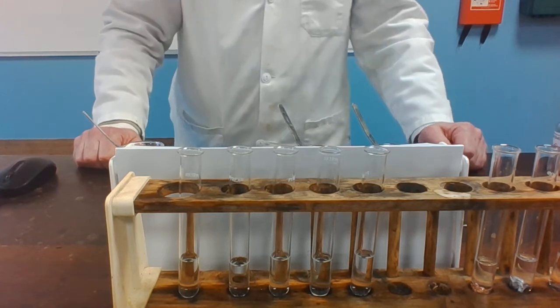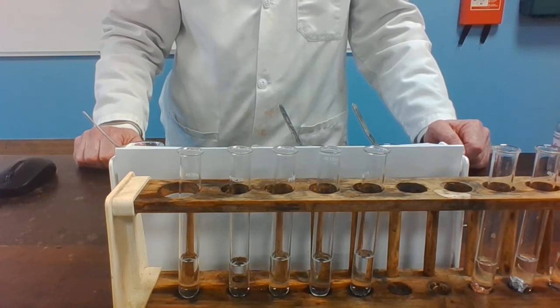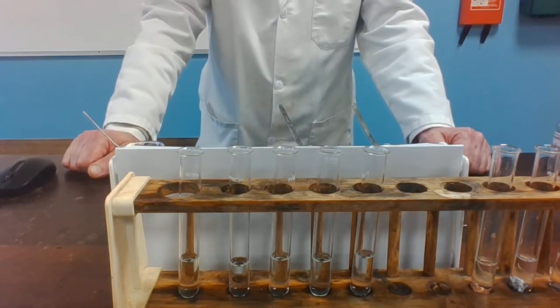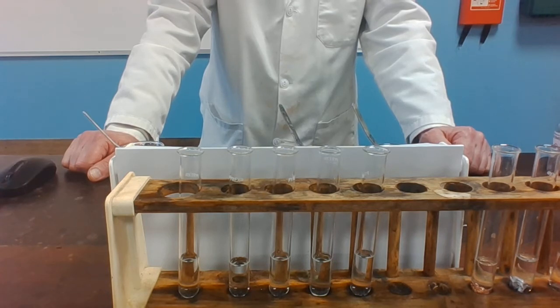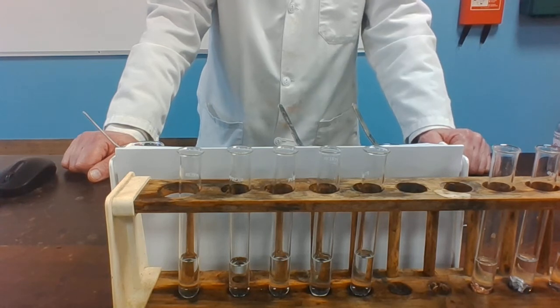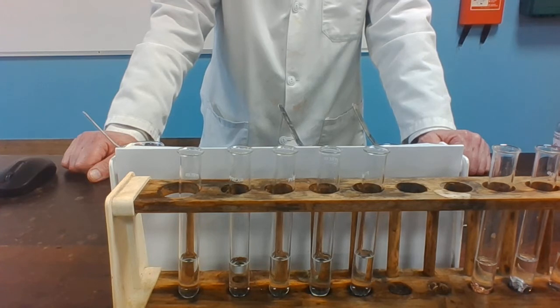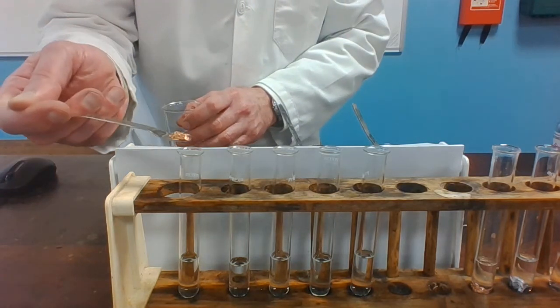We are now going to repeat the experiment but this time using dilute hydrochloric acid. This is reaction two, the reaction with dilute hydrochloric acid. Each of these five tubes contains dilute hydrochloric acid, and again I'm going to add copper, zinc, lead, magnesium, and iron to the tubes. I want you to look to see if there's any hint of a reaction. If there is a reaction, can you differentiate between whether it's very fast, medium, slow, or no reaction at all? Please write your observations in the table on the sheet. So we start off with copper turnings in dilute hydrochloric acid.